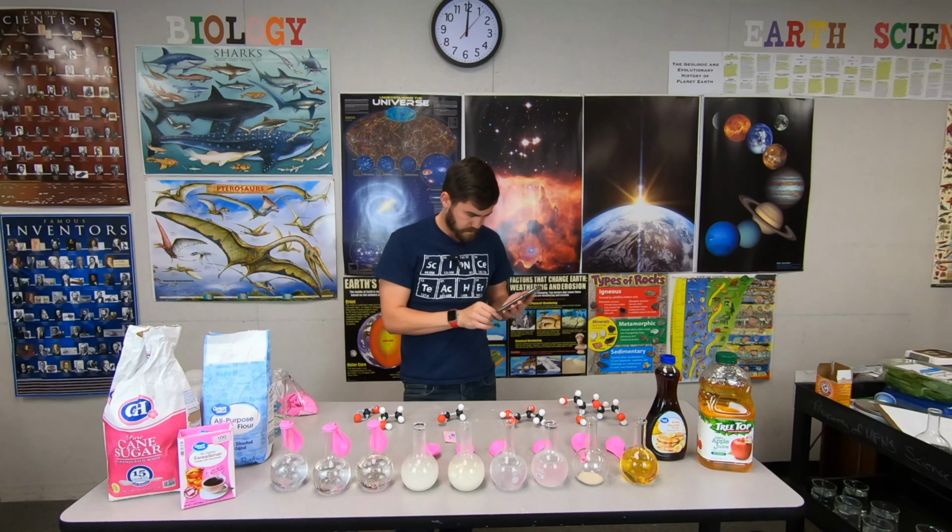What I'm doing right now is I'm squeezing each balloon to try to have as little starting air as possible in there. We don't want our lab results to be affected by user error, and I would be the user.